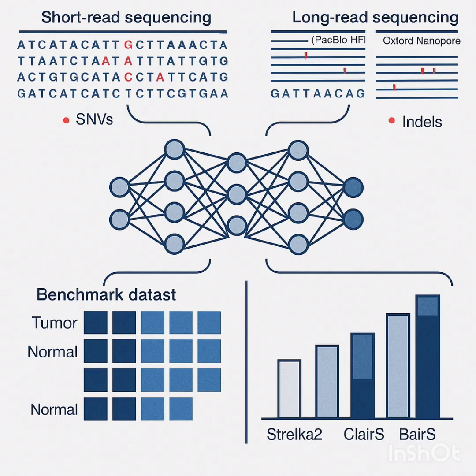It's a deep learning thing, right? Designed to tackle some major hurdles. Exactly. Two big ones. The historical lack of really good training data and also the limits of the older sequencing methods. And let's start with that data bottleneck, because you mentioned that's key.